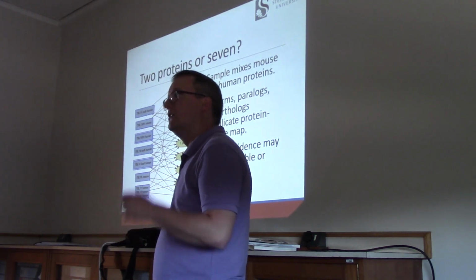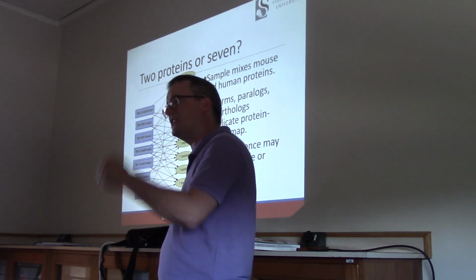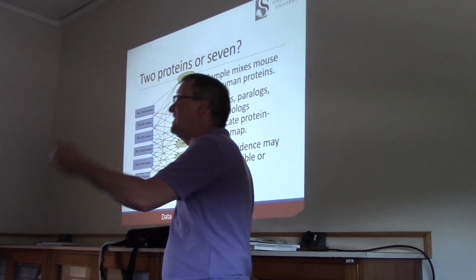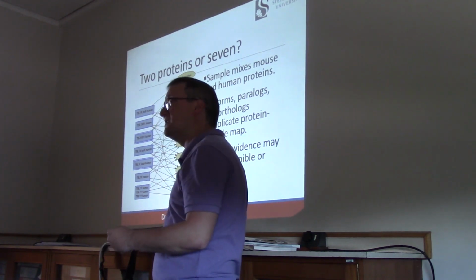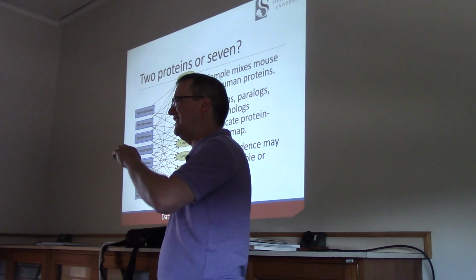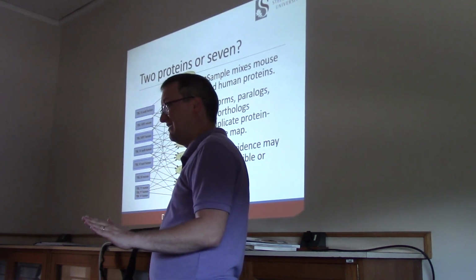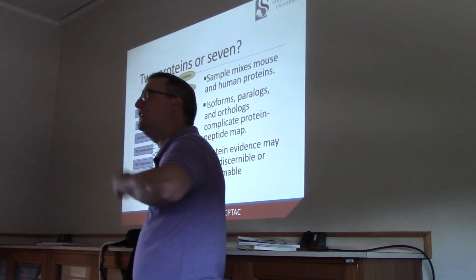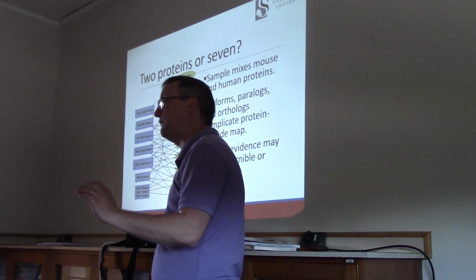In this case, I want to remind you that proteomics can provide you evidence that this protein is definitely here, but we have a substantial false negative problem as well. There may be other proteins present in the sample, and its absence from a protein list does not mean, in any case, that we've proven it's not there. Okay? Point of confusion, but it's true. We can tell you things that we know are there, but there are things there that our technologies are not sensitive enough to have detected.